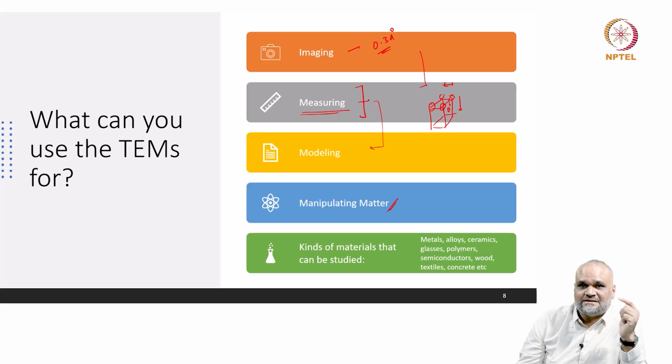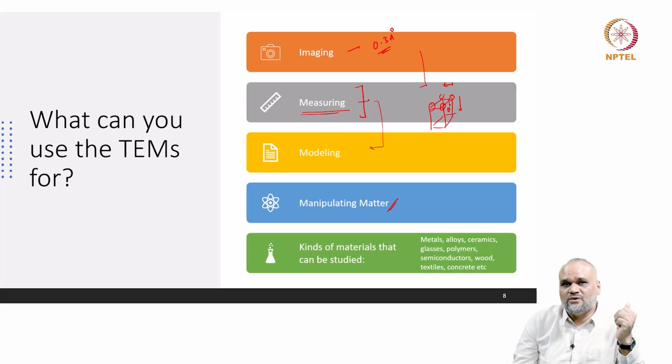If your specimen is prepared the right way, and while it is interacting with the electron beam in the microscope, I do not have any effects like degassing, decomposition, deterioration of the sample, or interference with the electron microscope vacuum, then under controlled conditions, I can study any kind of material. The details on how you can study different kinds of materials can be touched upon at a later stage. So if prepared carefully, if you meet all the criteria for how you can see the sample within the microscope, and if you get meaningful information from this, you can essentially study all kinds of materials.